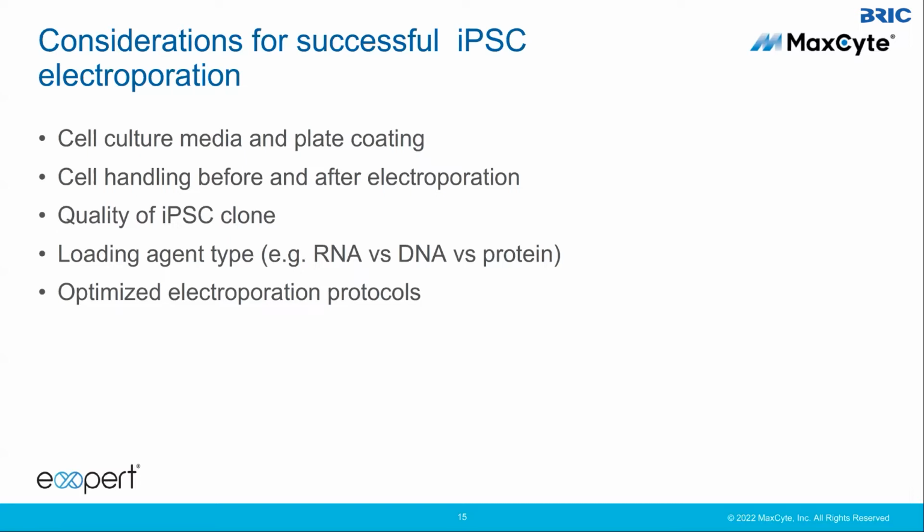Cell handling before and after electroporation is actually very critical. I know some researchers who scrape the cells to dissociate them before electroporation, but that really sensitizes them to electroporation damage. So you probably want to dissociate them as gently as possible.